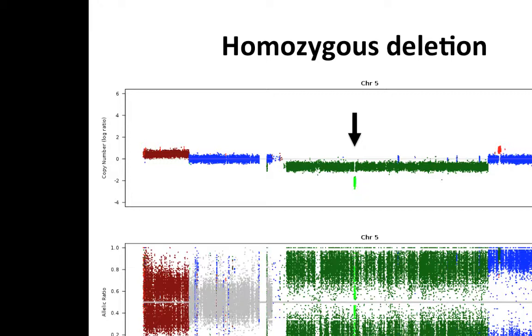Here you have a very clear homozygous deletion. You would rarely expect to see a homozygous deletion much bigger than that locus, because taking out both copies of a gene will very likely have a deleterious effect on the cell if it's an important gene. Occasionally selection will operate to select for cells that have deletions of very tight loci — usually tumor suppressors or growth regulators. This locus probably contains maybe three or four genes at most, very likely just one.